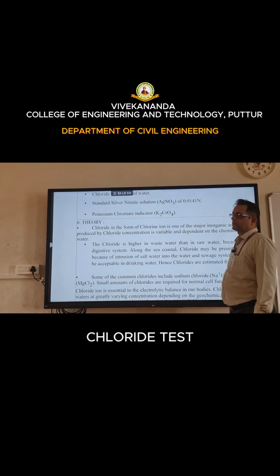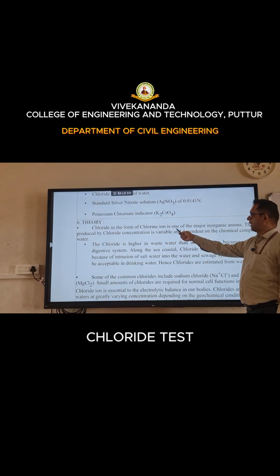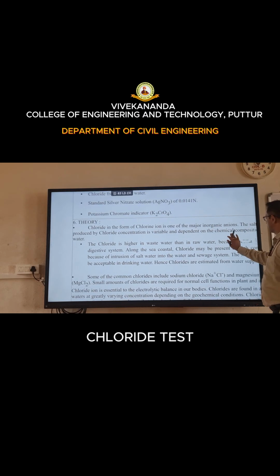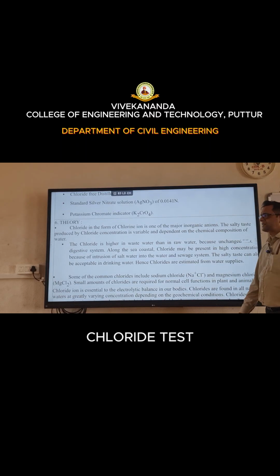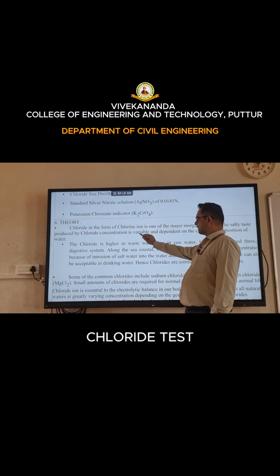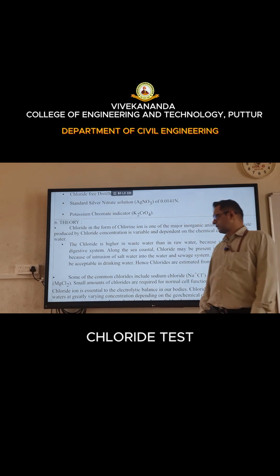So here, first the theory part. Chloride, in the form of chloride ion, is one of the major inorganic ions, which causes a salty taste, right? The chloride concentration is variable and depends upon the chemical composition.